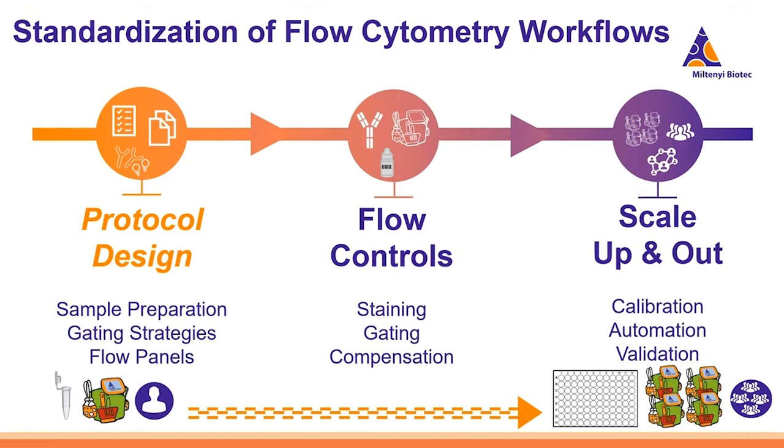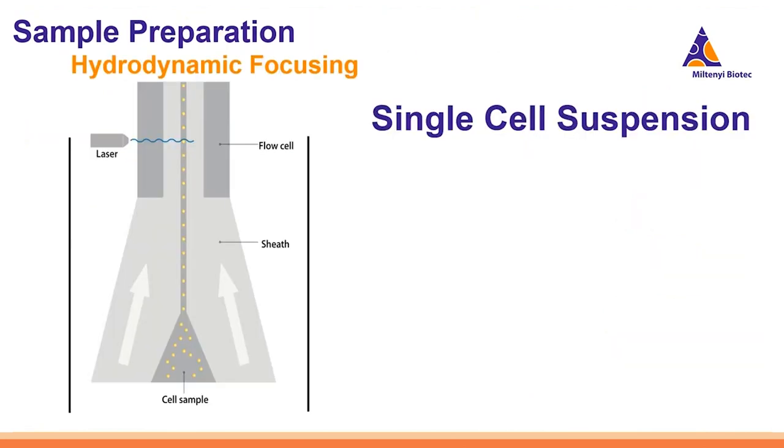Let's first talk about our protocols. And this, as I mentioned, are things like sample prep, gating strategies, and our flow panels. You might be wondering, why is sample preparation crucial to our flow assay?